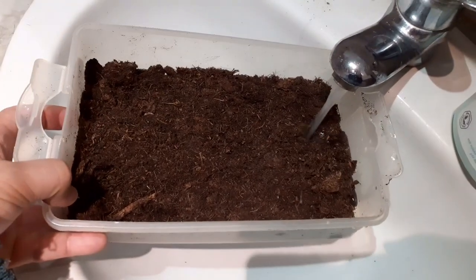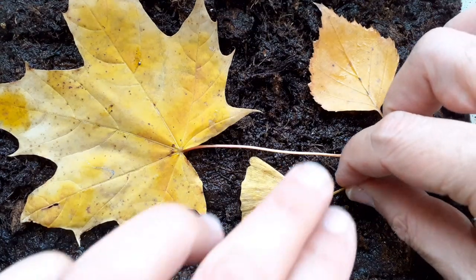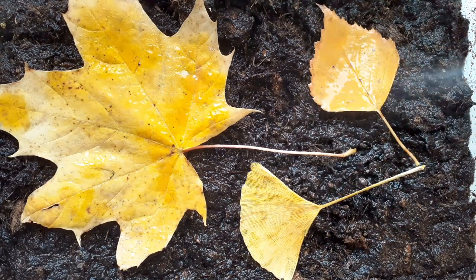A little bit of garden soil in a plastic container, plenty of water. You place the leaves on here — a maple leaf, a birch leaf, and also a ginkgo leaf. Then I sprayed everything with water, because you want to make sure it's sufficiently moist for all of the microorganisms to start working.